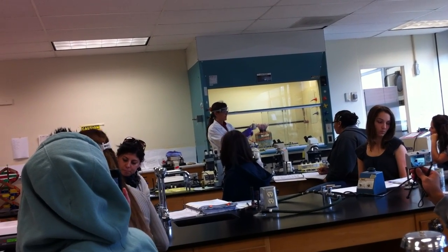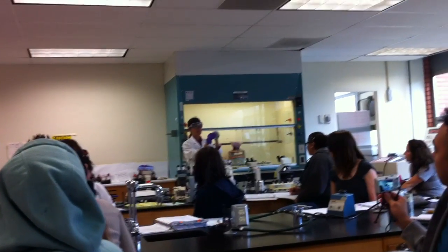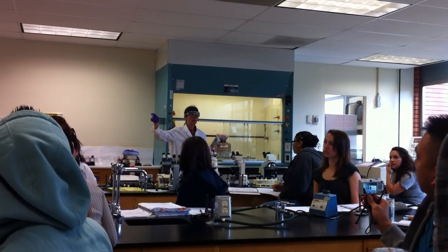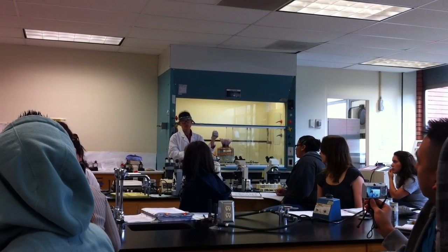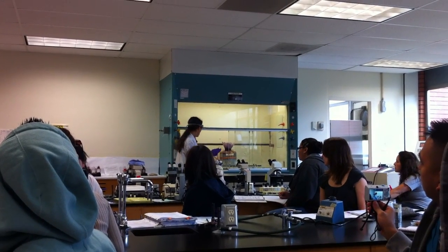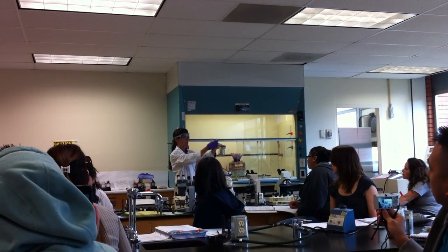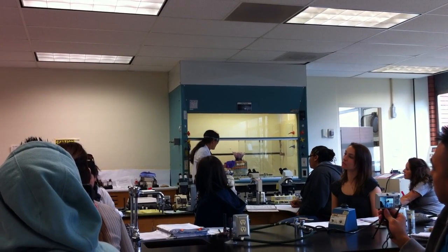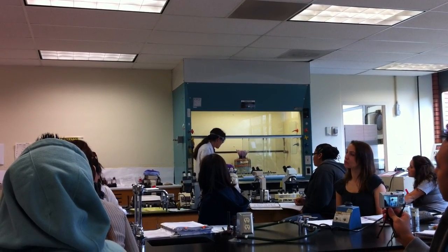Also, folks, the containers of alpha-naphthol, try to use them up if you can. Like, for example, with this one, maybe I have a little residual. What I'll do is look at the board and see the next person. I'll call their name, and when they come up, you just ask them, I have a little bit of alpha-naphthol remaining, would you like to use it? Ideally, we want to use it up if we can. When you're finished, we have these very low-tech waste cans, and it just says EPA waste. So you just put your little dropper bottle in there, because that too has to be treated as chemical hazardous waste.